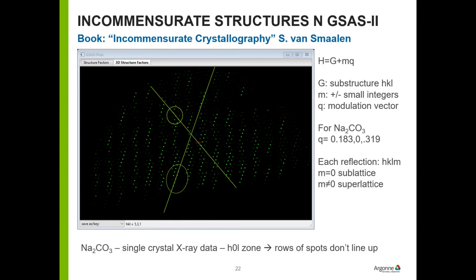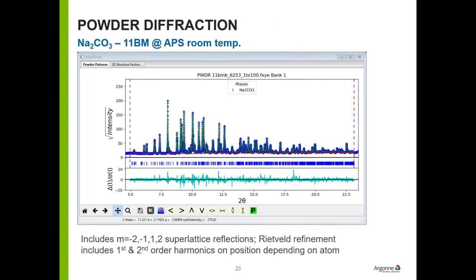Now, what happens in a powder pattern? Well, here's a high-resolution X-ray powder diffraction pattern of sodium carbonate at room temperature. This is right out of the bottle and taken at APS. And most of these reflections are, in fact, superlattice reflections. It's a really complicated little pattern.